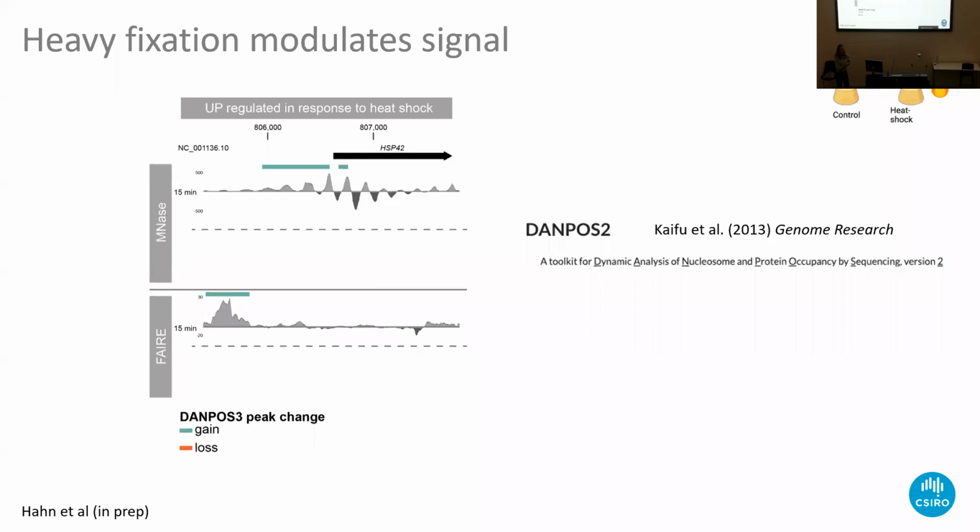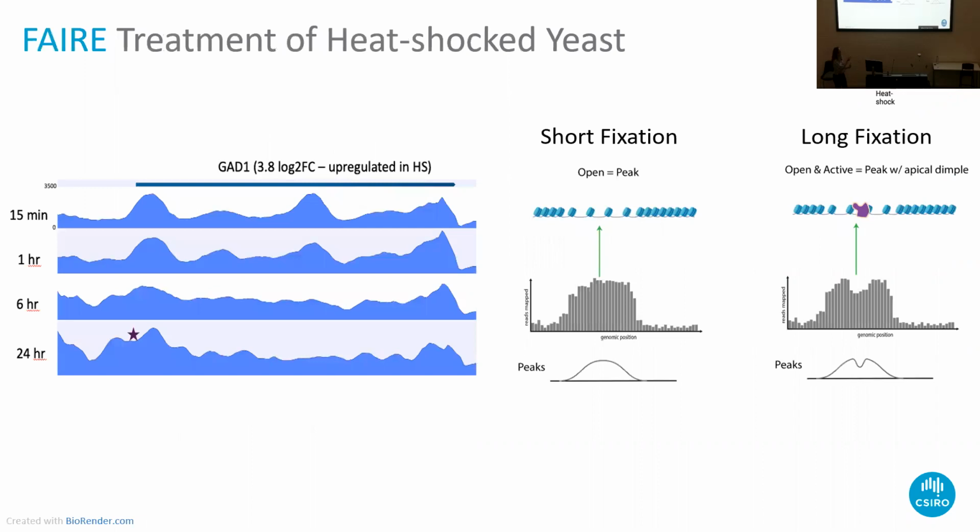Again, looking at what we're able to do with this kind of data, we took advantage of having run this experimental environmental change on the yeast, in response to heat shock. It took us a little while to figure out how to analyze these data, because as you can see from this slide, it isn't just enrichment. Sometimes it's that nuance of depletion that we're looking for.